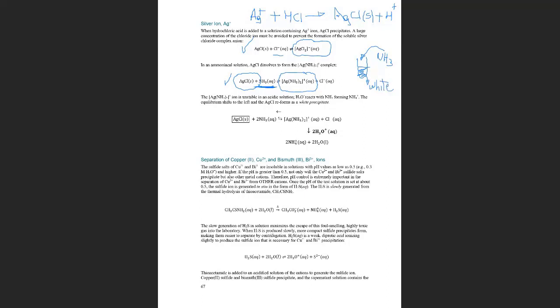Then it's another indication, a confirmatory test, that you have silver, because the silver with ammonia forms this complex, which is silver, ammonia, 2, plus. Does it make sense?